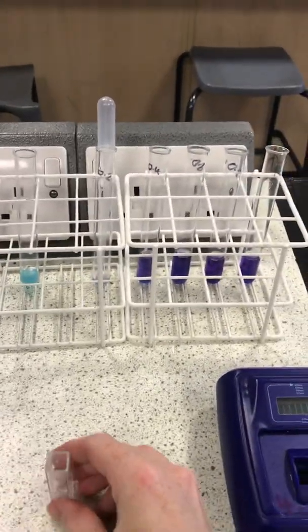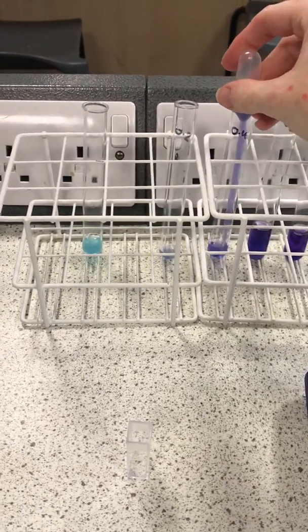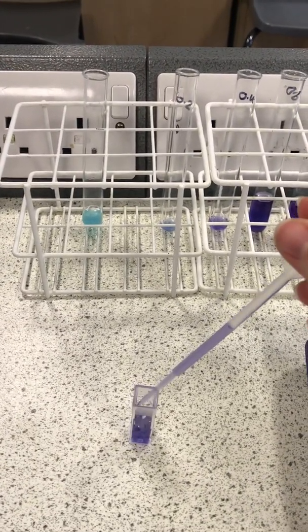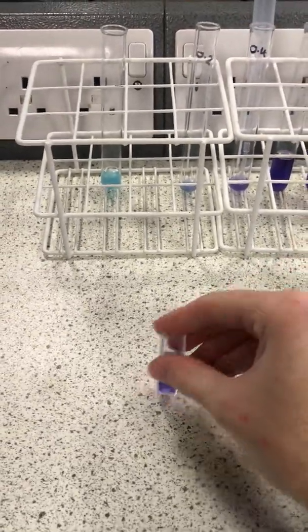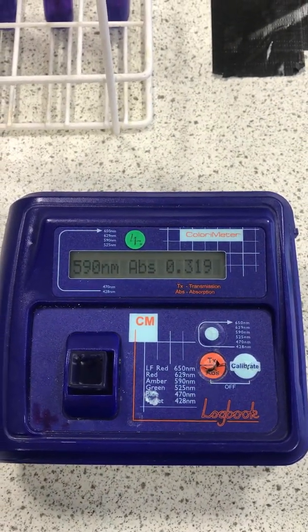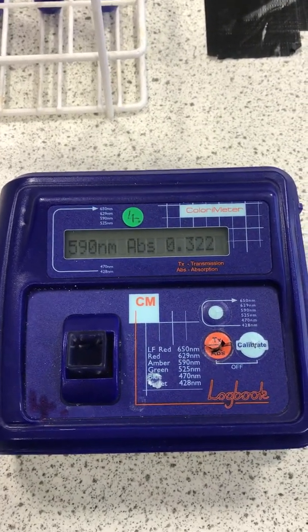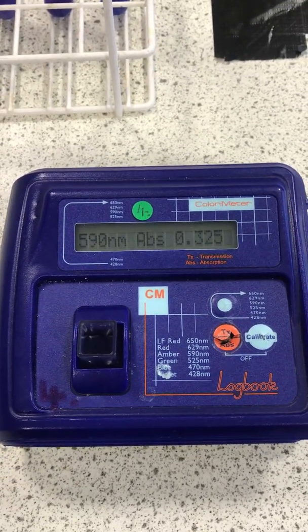Get rid of the waste. Giving it a good mix. And transfer that into the cuvette. Put that into the colorimeter. Okay, so we can see here that we're getting a higher data reading, and again that makes sense, but this time it is quantitative. We have numbers generated rather than opinions.